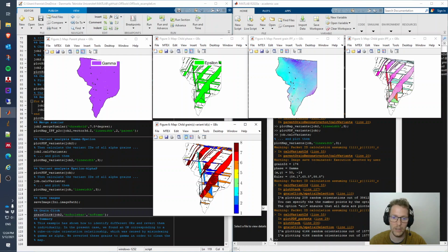This is actually why I personally introduced this no scale bar, no frame, because you often have this kind of boxy frame around it and the scale bar, which sometimes overlaps with your data. If you have a nice map that you want to show and just want to highlight one grain, it's nice to be able to get rid of the scale bar and the frame and just copy this grain and put it somewhere into a figure. So these are options you can use.